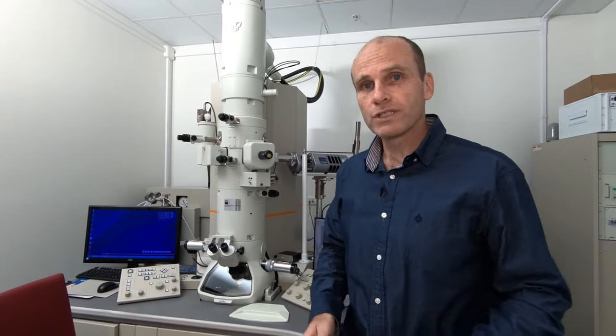So I hope that you've learned something from today's video. And I hope that we might see you in here in the CAF labs in the future to use TEM in your research. And I wish you all the best with the rest of your course and your studies at QUT.